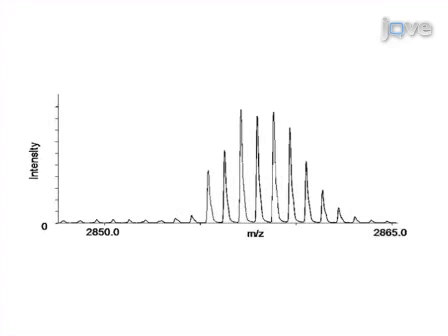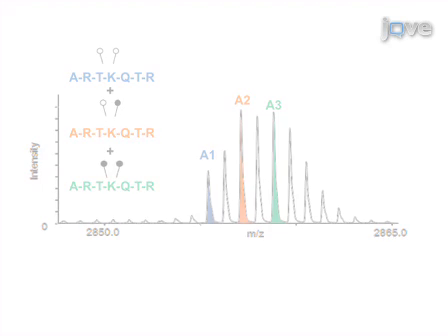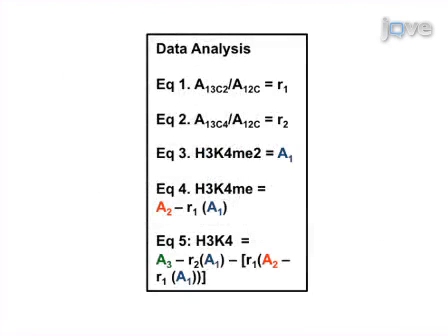Proceed to quantify each peptide species with MALDI-TOF mass spectrometry and account for isotopic overlap in order to identify relative amounts of mono, di, and trimethylated peptides. The MassSQUIRM results determine relative amounts of each demethylase reaction product based on changes in mass.